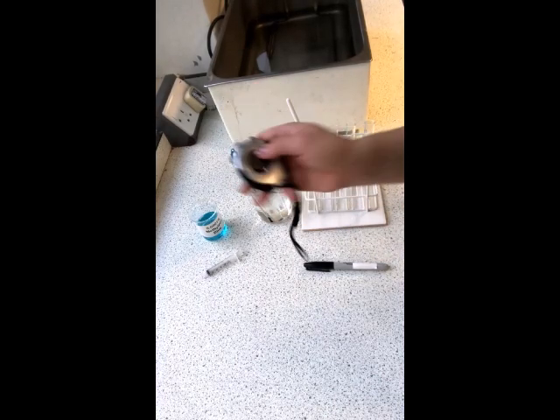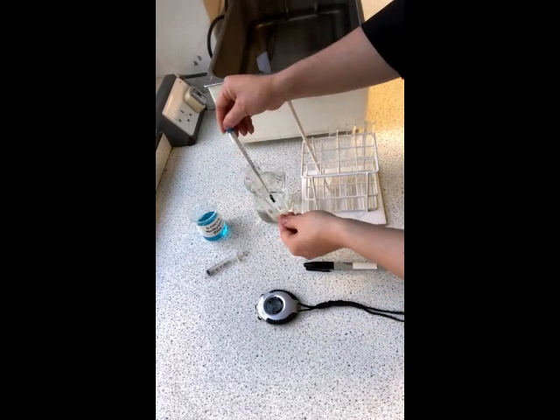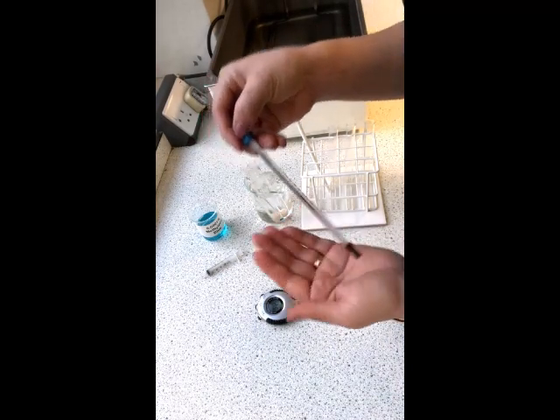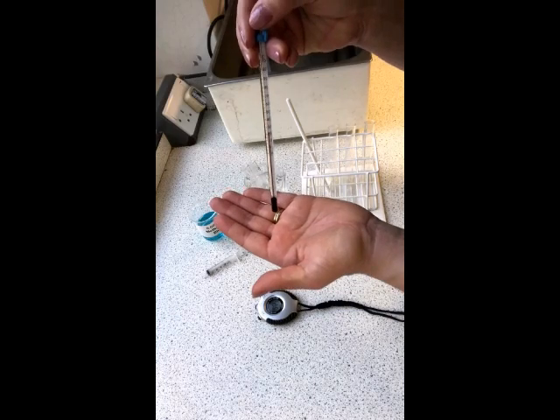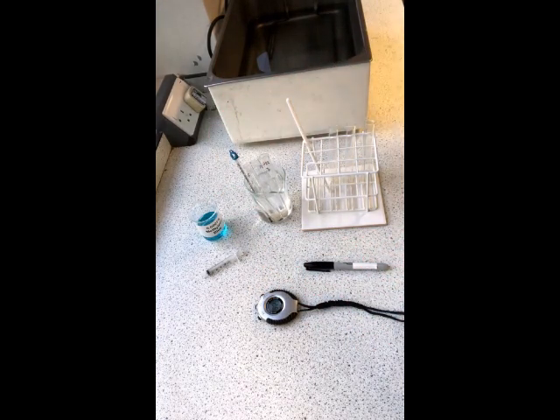Okay, so we have reached our 5 minutes. Using a thermometer, we can just double check the temperature of the room temperature water. As I say, it's about 23, if you can read that. So these should hopefully have reached the right temperature. So now we can move on to actually adding the methylene blue to it.